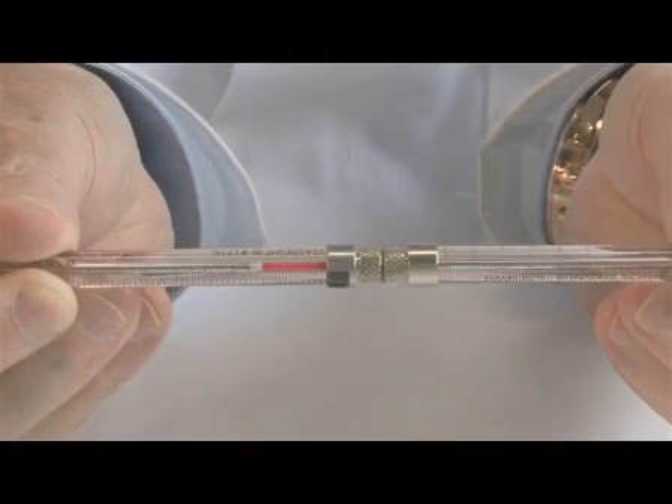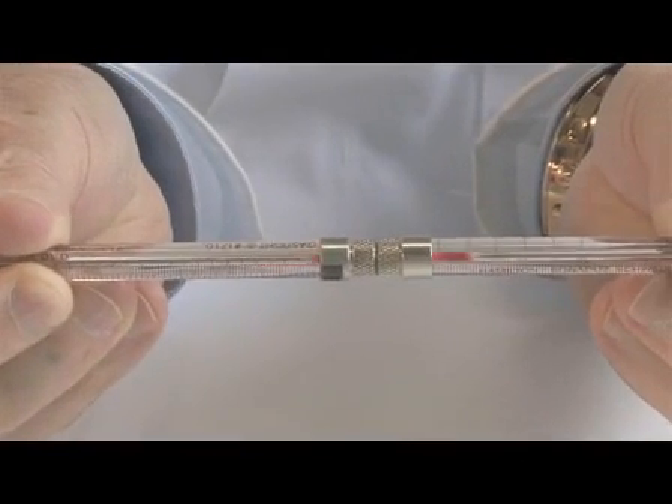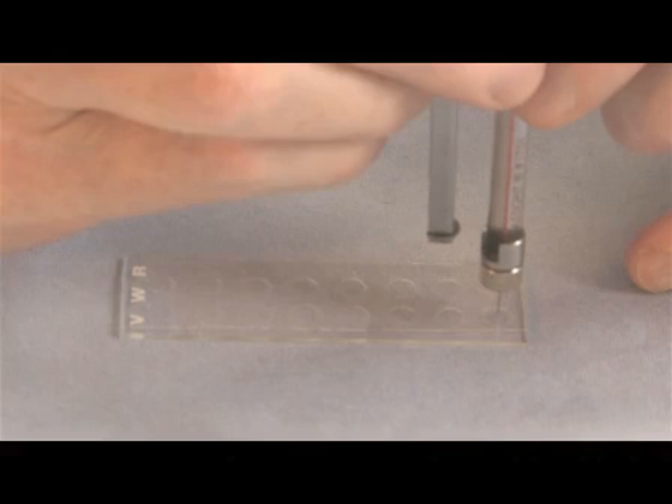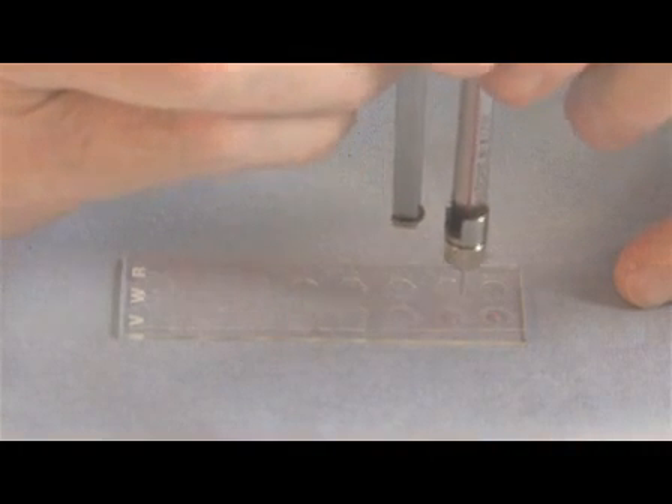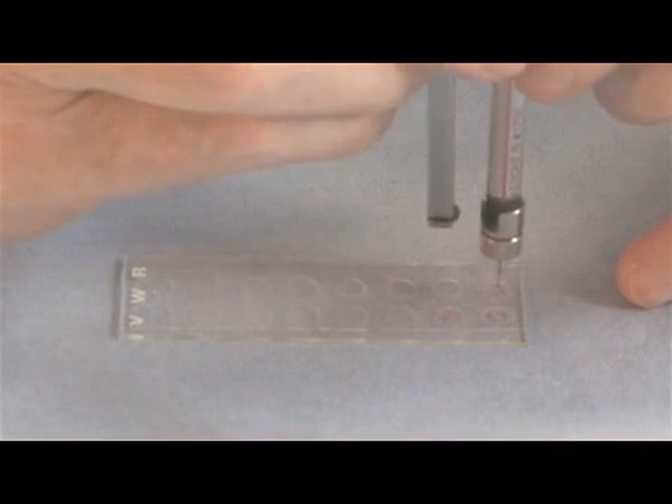In the first article, JOV 1712, we demonstrated how the protein-laden cubic phase is prepared and how the viscous and sticky mesophase is dispensed manually into glass sandwich crystallization plates for crystallization trials.